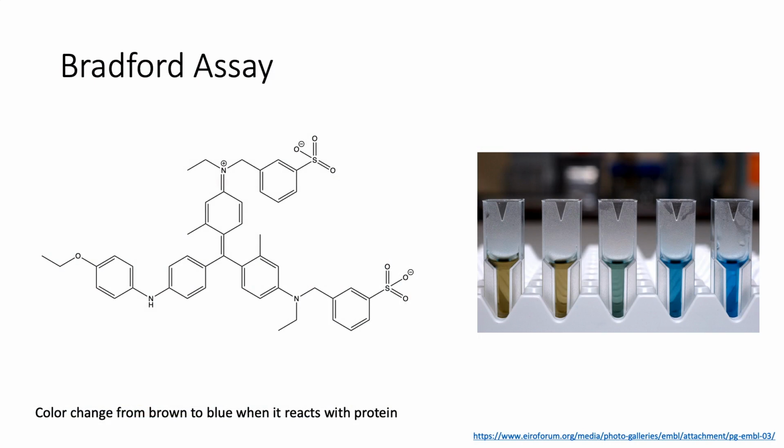So the Bradford assay is the assay that we're going to be doing in the lab. And the Bradford assay uses Coomassie dye, and this is the structure of Coomassie dye.